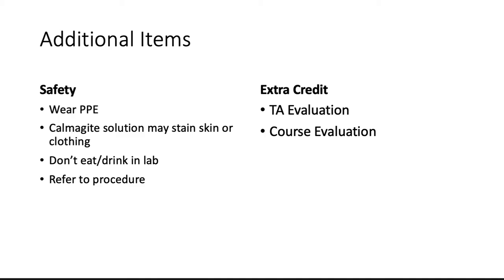Safety this week, the Calmagite solution can stain your skin, so you should be especially careful of that. And you shouldn't eat or drink anything in lab like the hard water samples that you have.